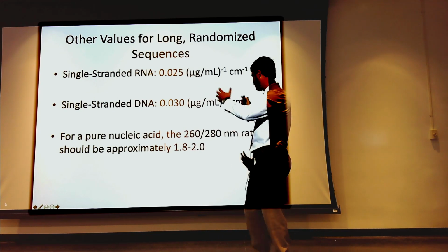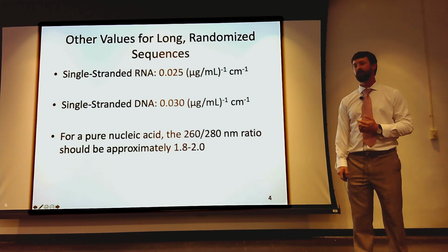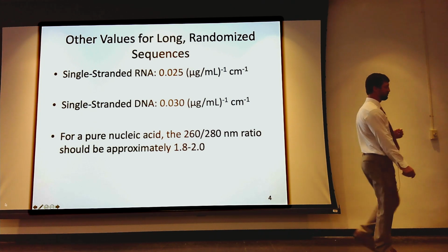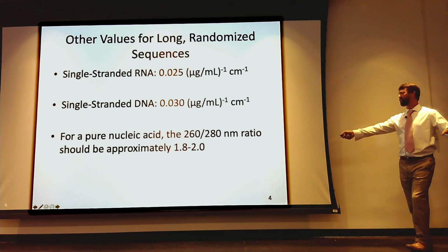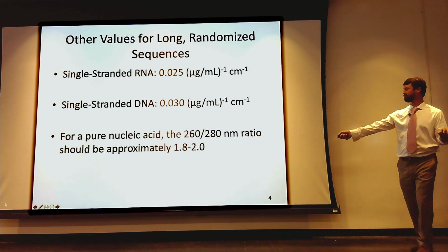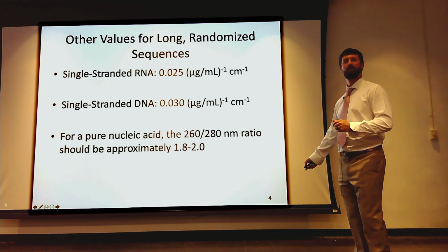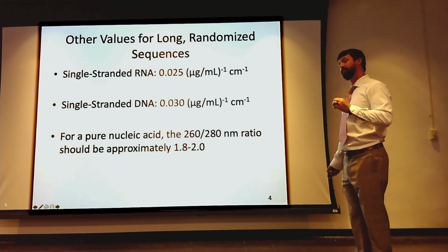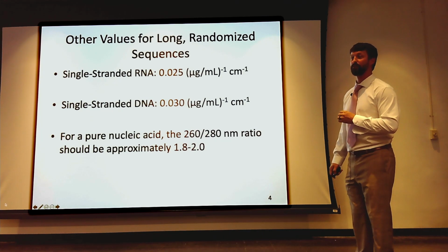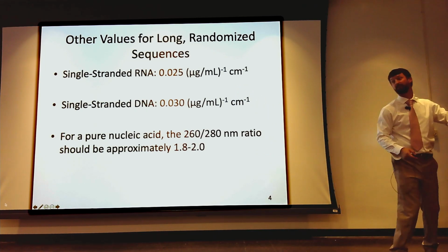So now you go to isolate, you put your plasmid in, you did all your molecular biology for 6 months, you're overexpressing in E. coli, you purify your protein, and you want to know how much DNA contaminant you have. You can look at your absorption spectra. And you can see from UV-vis, do I have some nucleic acid at 260? What's the third wavelength that we usually monitor for overexpression? 260 is nucleic acid, 280 is protein. What's the other one? Say again? No. 214 is very helpful. 214 tells you about the amide backbone bond, right? So if you have a protein that doesn't have an extinction coefficient, say you're purifying on something like HPLC, you can monitor 214 to look for your peak.